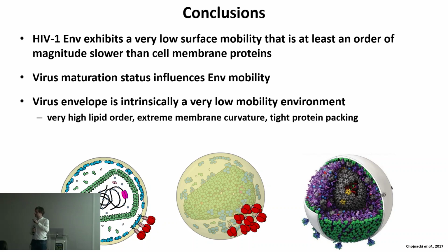Then no, the mobility did not increase. Exactly, with a CT mutant, which is much more free to move, we found that it was also around 0.02. So once again, it's intrinsic, it's about the membrane rather than whatever GAG-ENV interactions you have.